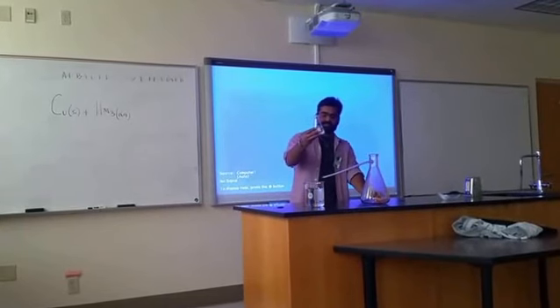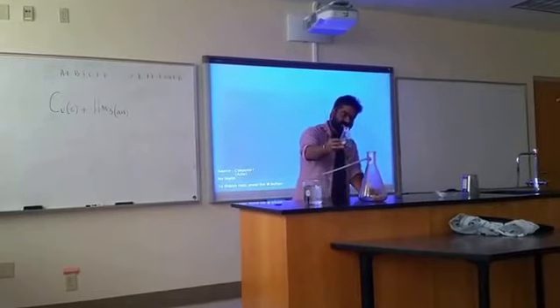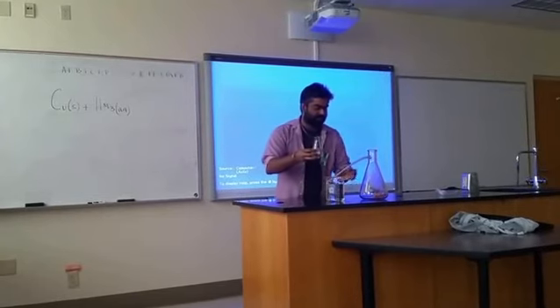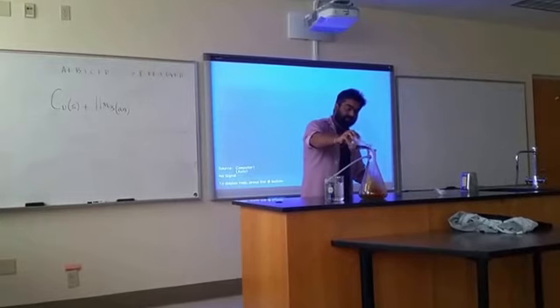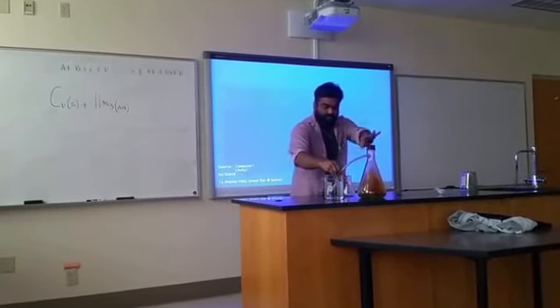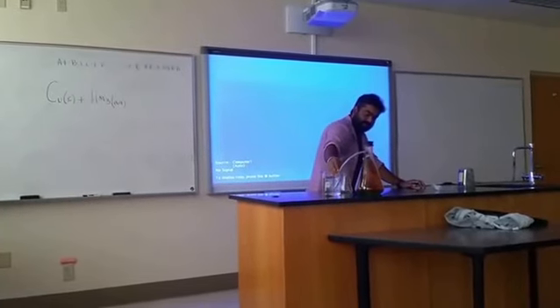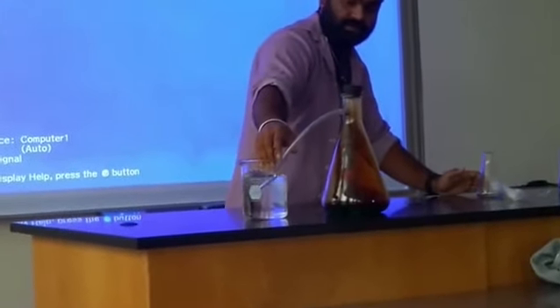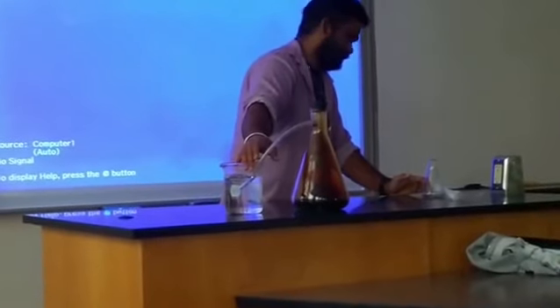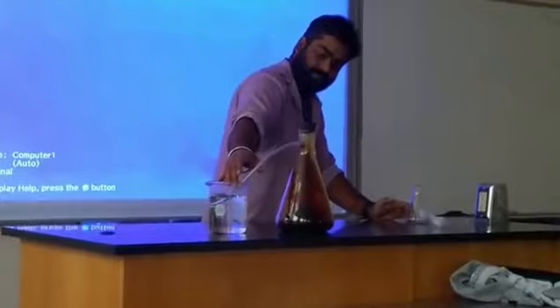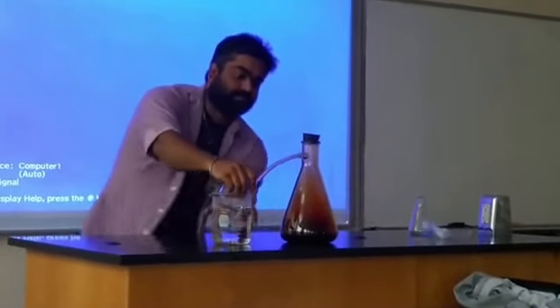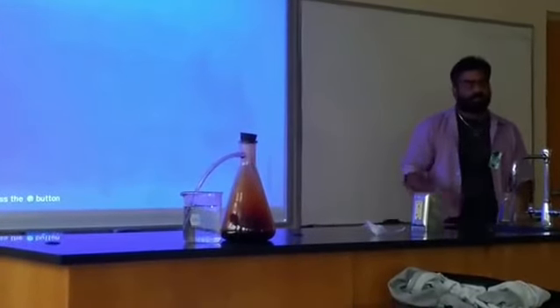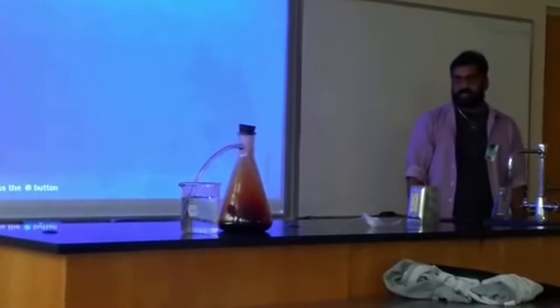I'll add concentrated nitric acid — this is not diluted, this is pure concentrated nitric acid. I'm going to put this in here and place this in a beaker of water. You see that red fume? That's the copper reacting with the nitric acid. What you see now is this red fume — that's the NO2.